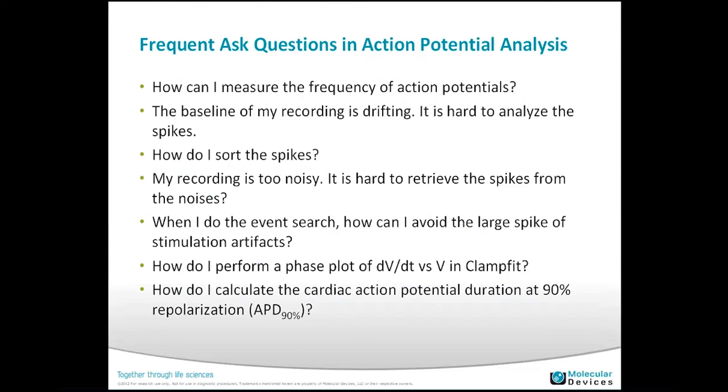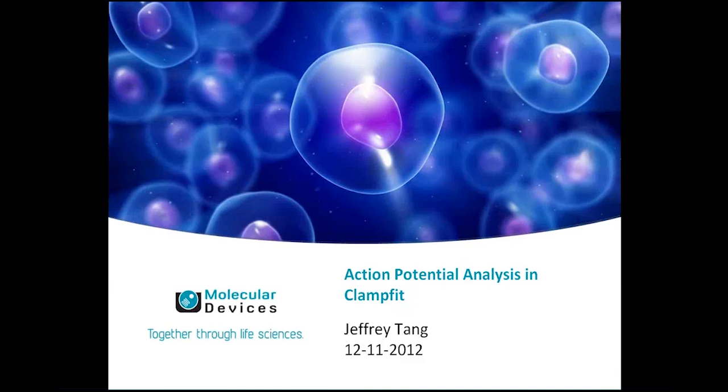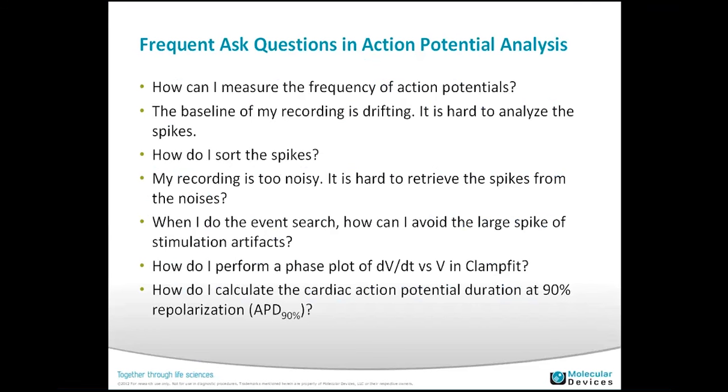So I have received questions, so let me start. Today my presentation title is Action Potential Analysis in Clampfit. In the past several years, I have received questions from customers asking how to analyze action potentials. The following are the frequently asked questions.